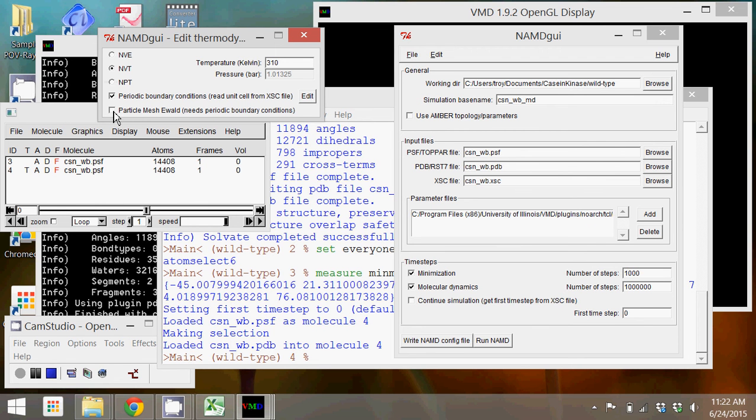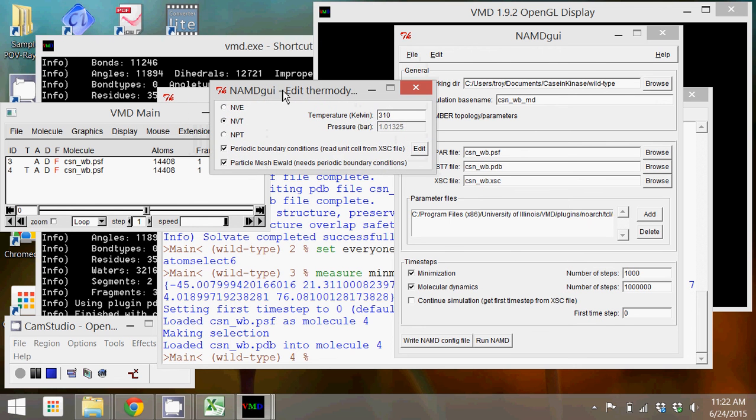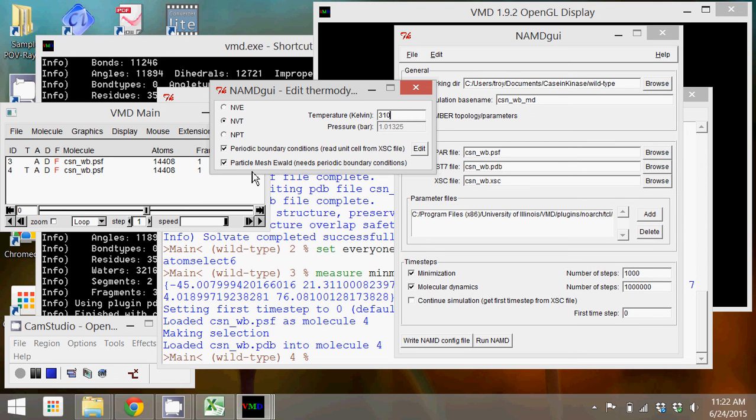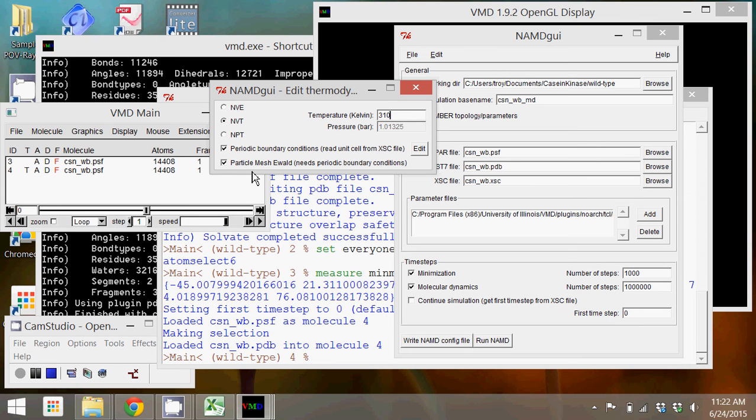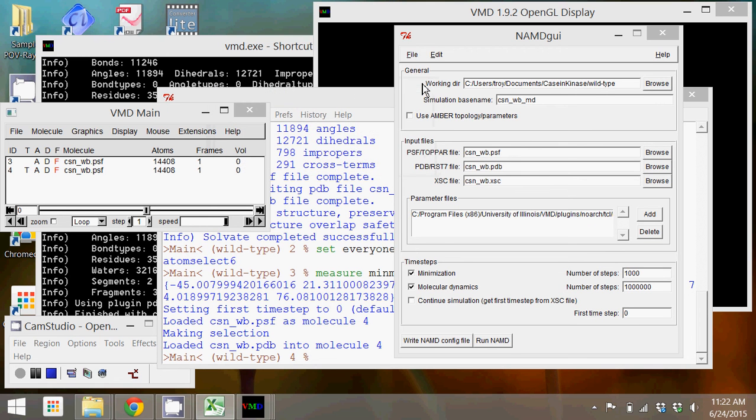If we select this particle mesh box, then what will happen is the program NAMD will create a grid where it calculates the electrostatic interactions on a grid rather than calculating them for every distance between every atom and the protein structure. So that's a way of speeding up your simulation, but because you're calculating something on a grid, it is going to give you a little bit less accuracy than it would if you didn't use that. But we're going to check it just for the sake of speed.